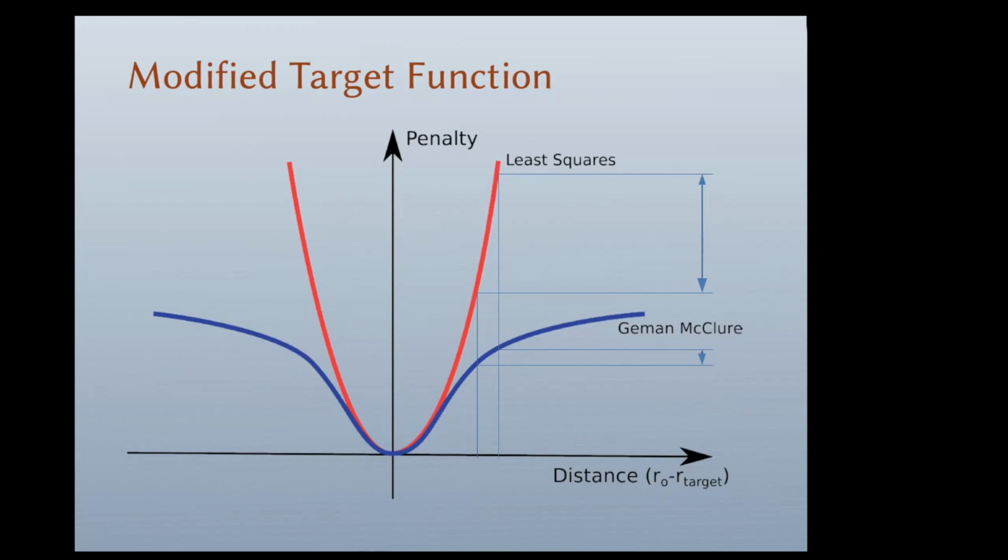And often when I'm doing this sort of modeling, I can see that the restraints are too strong. So there's a menu item that allows you to change the weight. And so it can be adjusted, either to increase the weight or reduce the weight, depending on how the model's behaving.